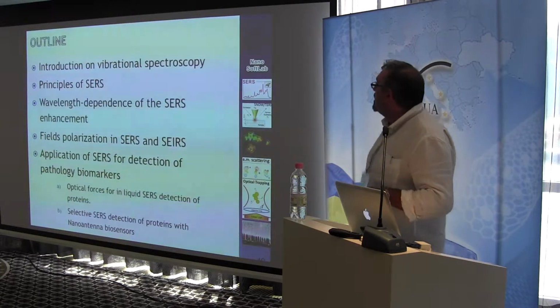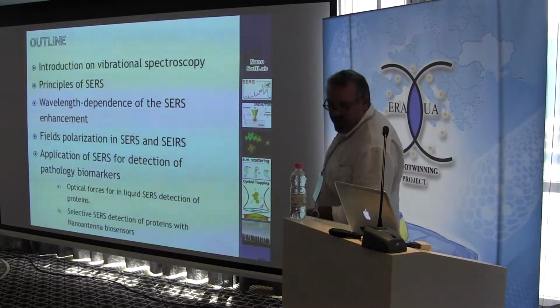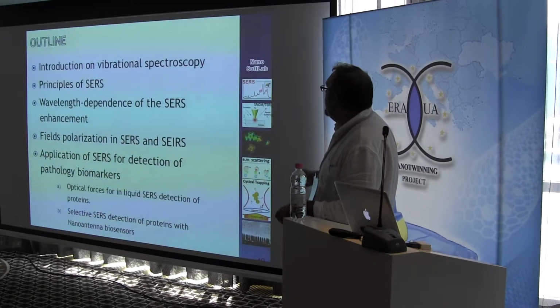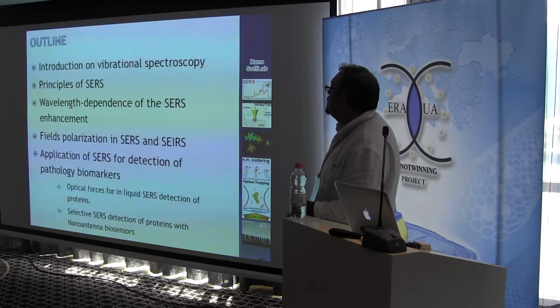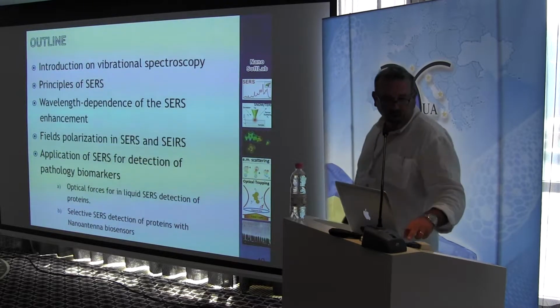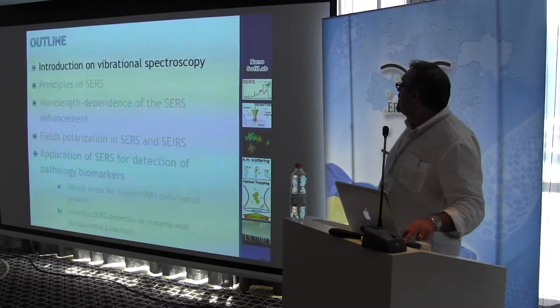So let's go to the scientific part. I've planned to talk to students, so I've planned to give this lecture with an introductory part on vibrational spectroscopy, then introduce principles of surface enhanced Raman scattering, SERS, and go deeper with wavelength dependence of the enhancement and field polarization in SERS and surface enhanced infrared absorption, SEIRA. And then I will show you some applications for detection of pathology biomarkers. So let's go with the introduction of vibrational spectroscopy.